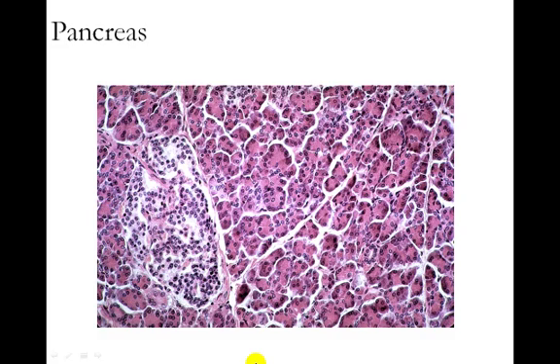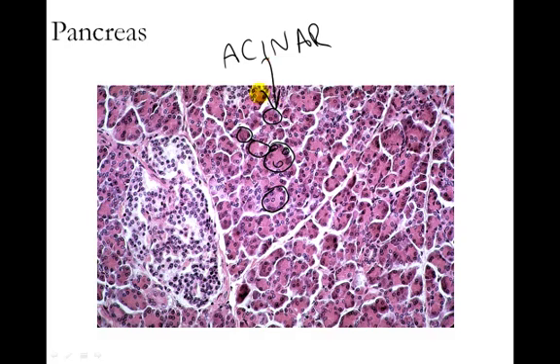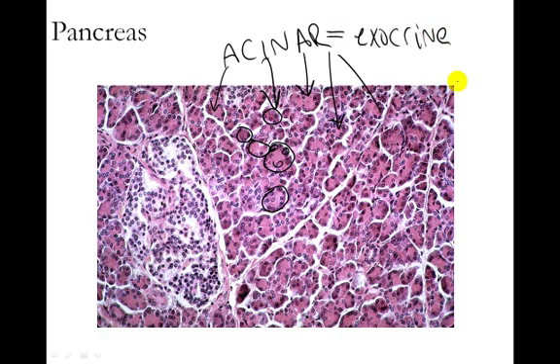If we look here, we're going to see a few different types of cells. First off, we see some very round cells that organize themselves in round orientations. In anatomy, we use the term acinar to mean round, so acinar cells are round cells. All of these stained in a reddish color in this particular image are the acinar cells of the pancreas. Those acinar cells are the exocrine cells of the pancreas, which secrete digestive enzymes — we'll talk about that in more detail in the digestive unit.